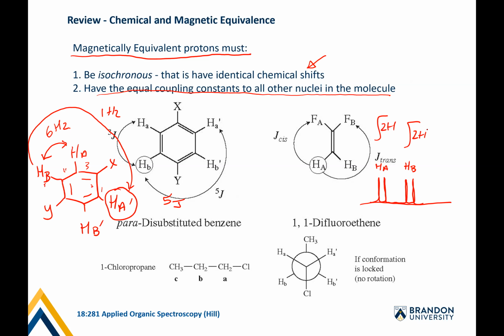But because of this coupling constant difference, you'll often see little side things on your spectra, little side spinning peaks, and the doublets just aren't perfect the way they should be. This is basically a consequence of the fact that they're not magnetically equivalent to one another. So one coupling constant is large, the J3, and one is small, the J5. So they're not what we call magnetically equivalent.